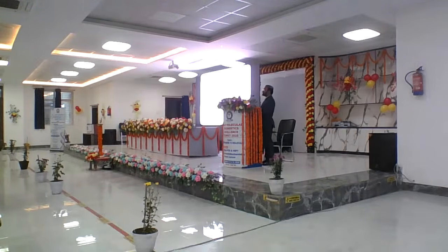Next slide. So to summarize, digital droplet PCR delivers precision in various scientific disciplines: healthcare, research, disease management, even environmental and biotechnology. The main advantage is that it provides a means for absolute quantification of your nucleic acid, which helps in various cases where real-time PCR is not good enough, or where you would have to go for NGS, which is far more expensive. So that is a valid enough option.